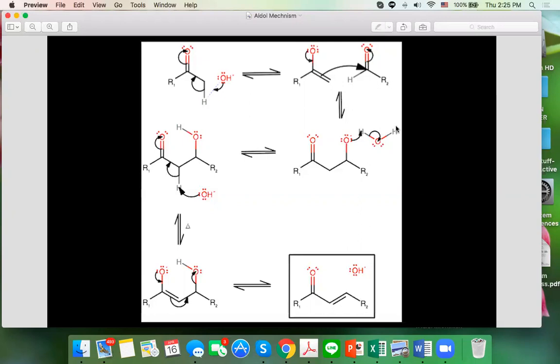So I can tell you the yield will not be very impressive. However, we don't want students to handle the sodium hydroxide in pellets in solid form. It's too dangerous. It burns your skin. It attacks your skin, and we don't want you to do that. So we use a diluted form by sacrificing the yield, because if you have water here, you know the reaction kind of gets pushed backwards.